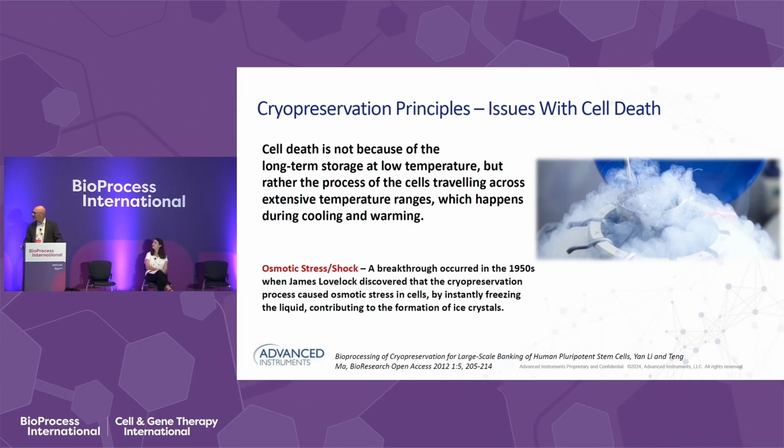The osmotic stress can be caused either by slow or fast cooling. In slow cooling, ice is formed in the extracellular environment, which causes an increase in the solution osmolality. To compensate, intracellular water passes through the cell membrane to the extracellular solution, thus causing cell dehydration and damaging the cell membranes. In rapid cooling, it's intracellular ice formation that causes the issue. The intracellular ice causes damage and insufficient water outflow in supercooling. Osmolality is key to understanding this process and assures repeatable results and the best cell recovery for your cryopreservation process.